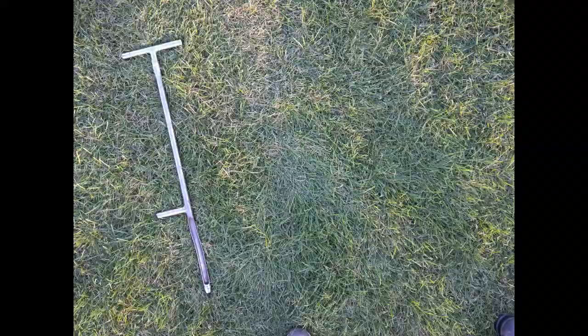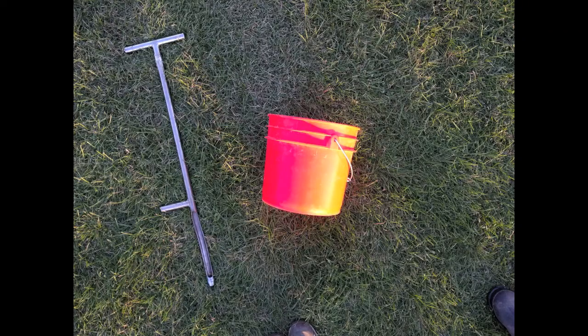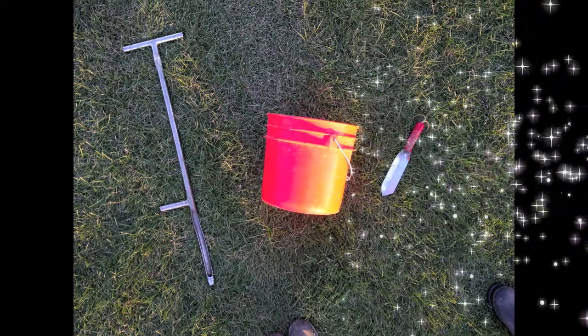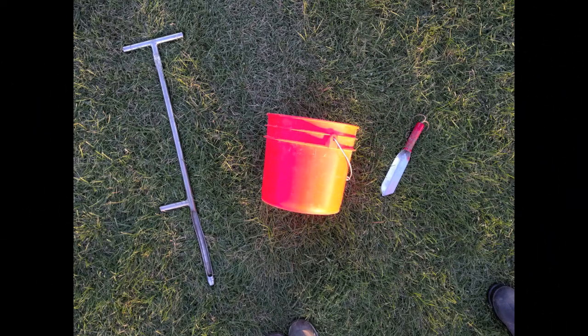Gather a soil probe and a bucket. If you don't have a probe, you can use a garden trowel. You may be able to borrow a soil probe from your local extension office. Have a Ziploc bag and marker handy for collecting and labeling your sample. Make sure your bucket and probe or shovel are clean, since we do not want any residue to affect the soil test result.